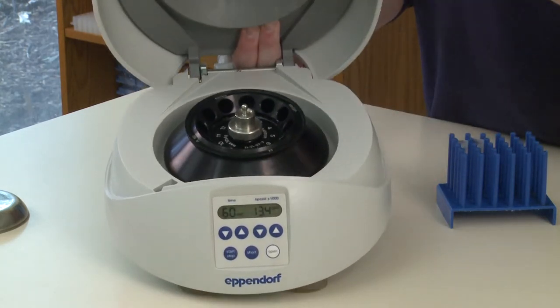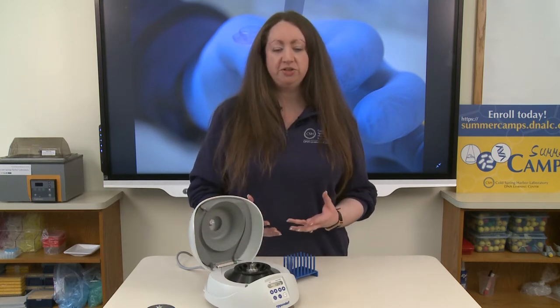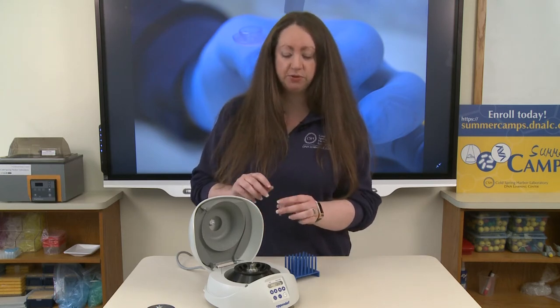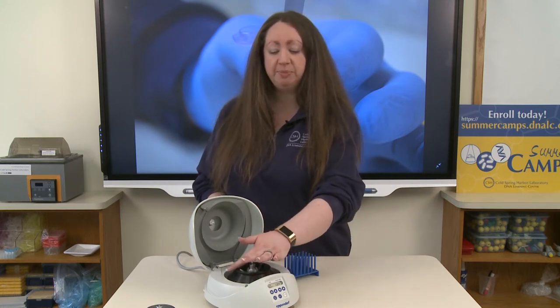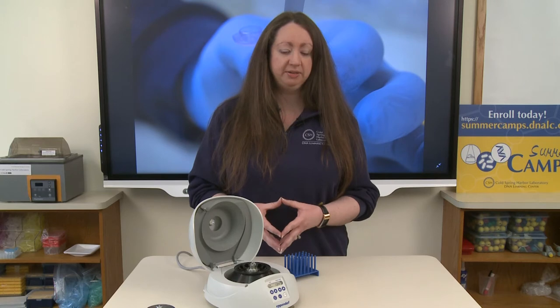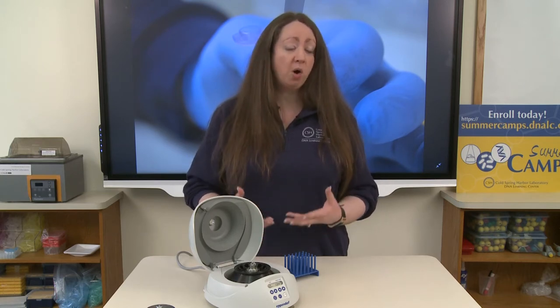It is very important when placing our tubes into the rotor to make sure that we have what's called a balanced centrifuge. This means that I cannot spin a single tube inside of my centrifuge. A single tube when the rotor begins to spin quickly will cause an uneven weight distribution across the rotor. The rotor will start to rock, and more violently the faster it spins. This can cause serious damage to the centrifuge and can also potentially harm yourself.